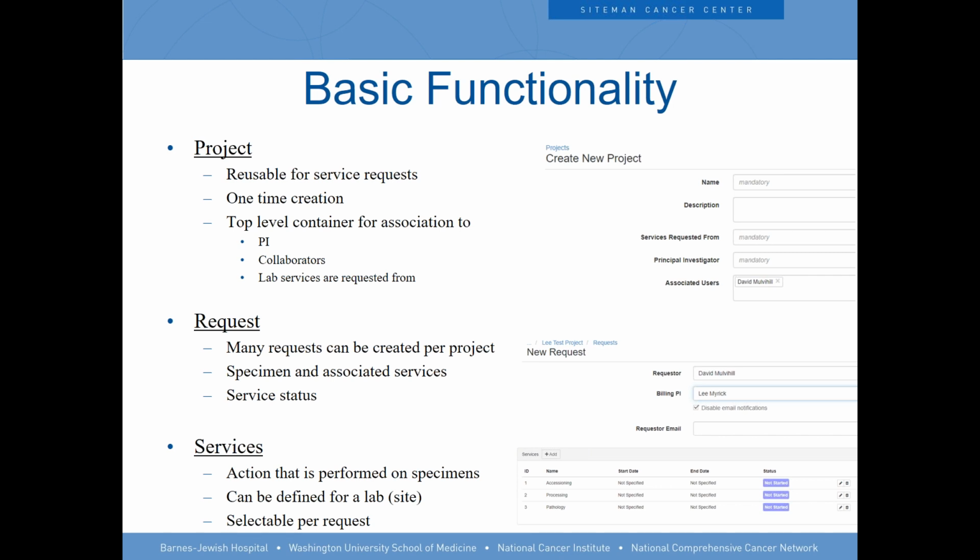Now, it gets a little tricky when those specimens are processed and we talk about tracking services and tracking billing and things like that. So at some point, those need to be instantiated within OpenSpecimen, either to a distribution protocol or a collection protocol or whatnot, so that we can further track services on those. But right now, there's nothing that would stop that type of request from coming through.